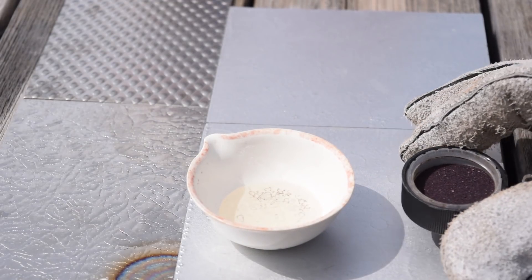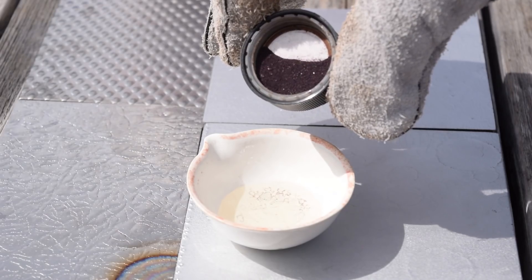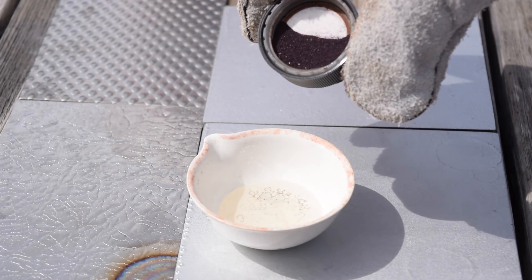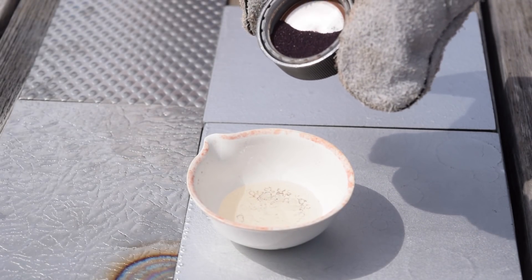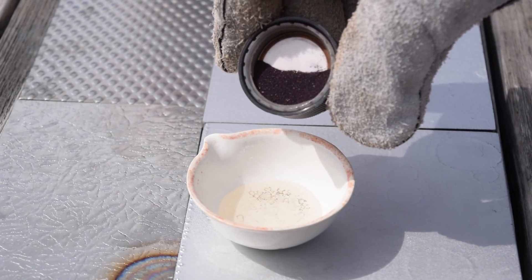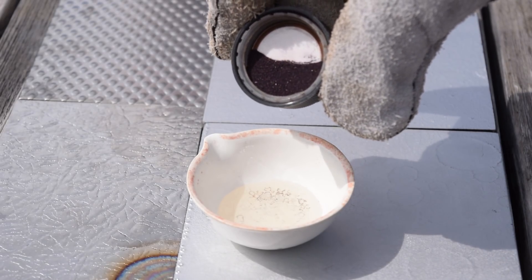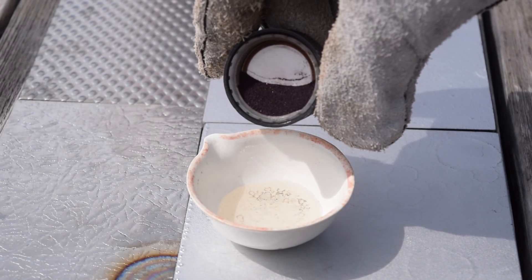Now I'm going to add a little bit of potassium permanganate. This will form permanganic acid at first, and the manganese sulfate — or potassium sulfate, I'm not sure. The sulfuric acid will dehydrate it; the permanganic acid will form manganese heptoxide, and that will be seen as a green color.